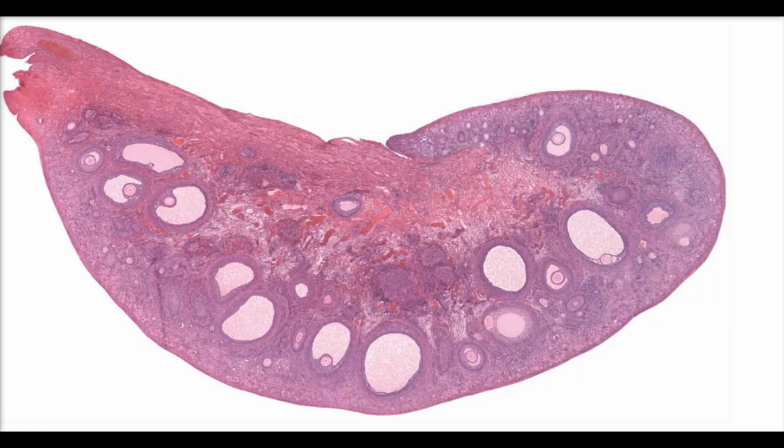This slide shows an ovary. The ovary is part of the endocrine and reproductive systems since it produces both hormones and egg cells. If we look at the outer layer of the ovary, we can see ovarian follicles in different stages of development. An ovarian follicle is simply an oocyte, an egg cell, plus the layers of cells that surround it. Those extra layers of cells produce the hormones.